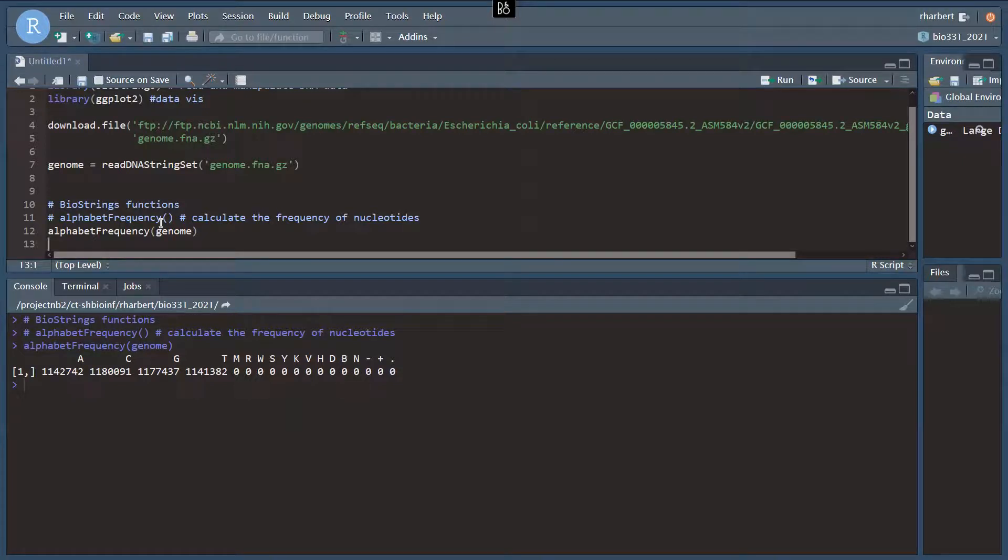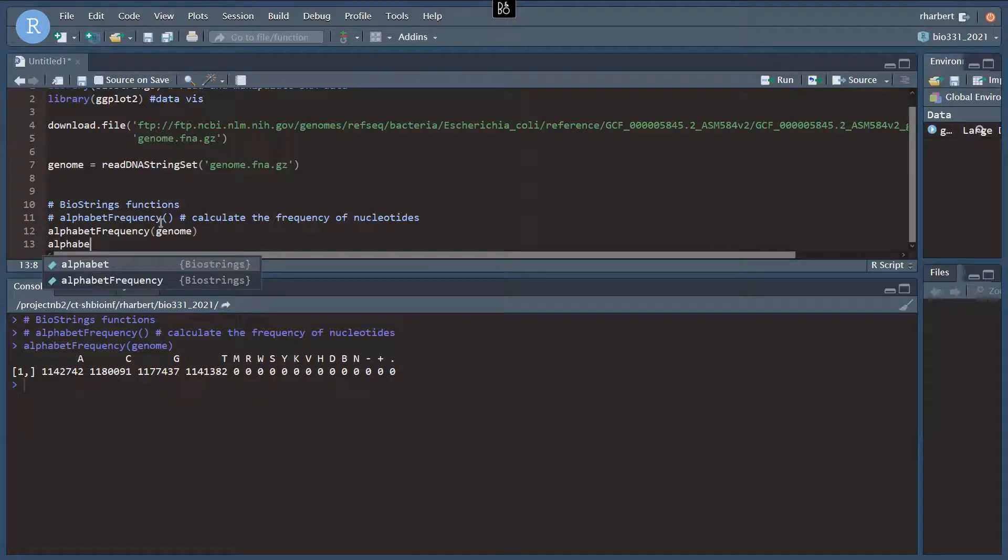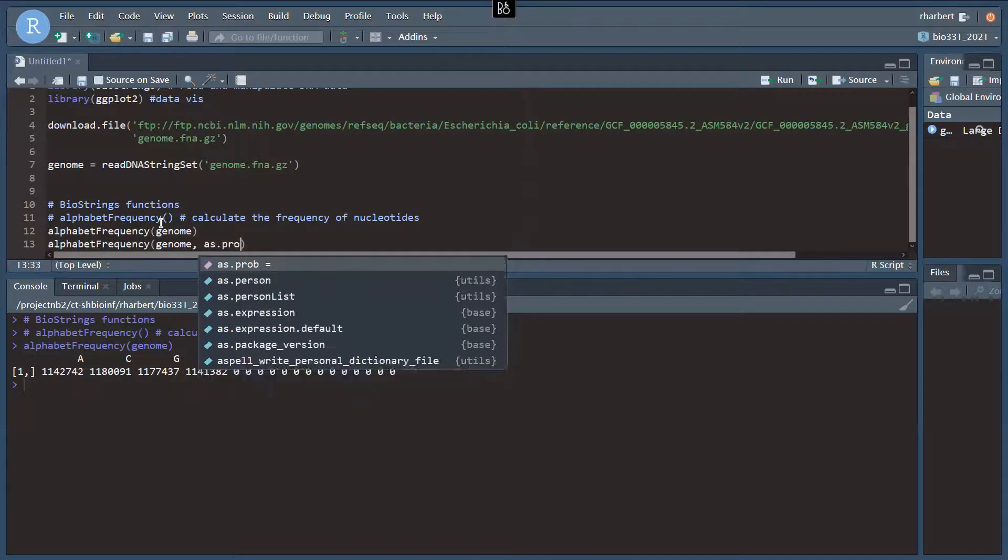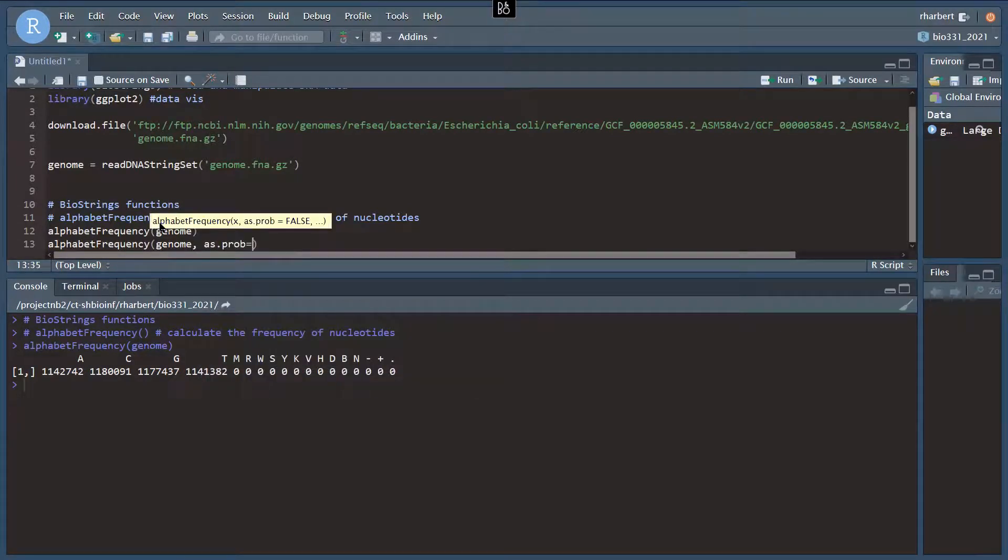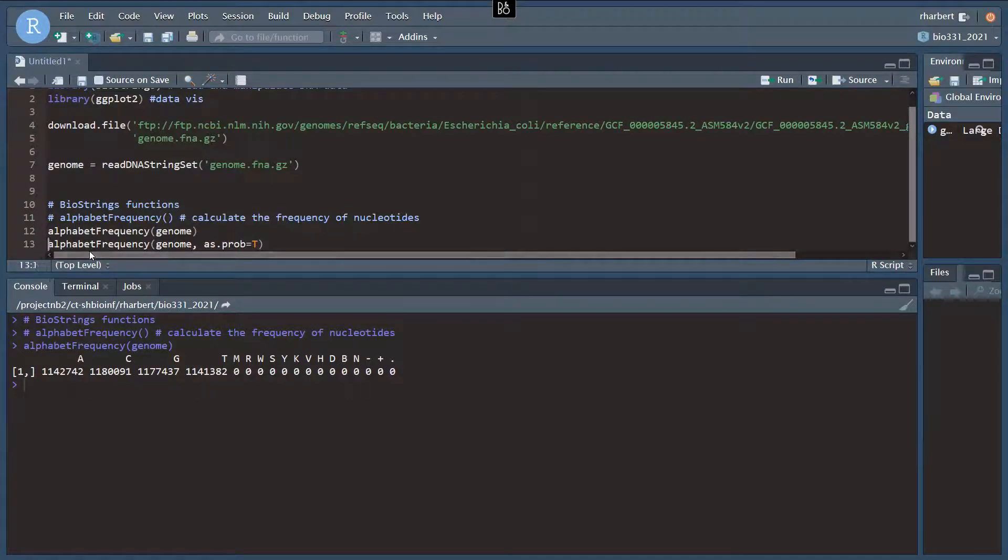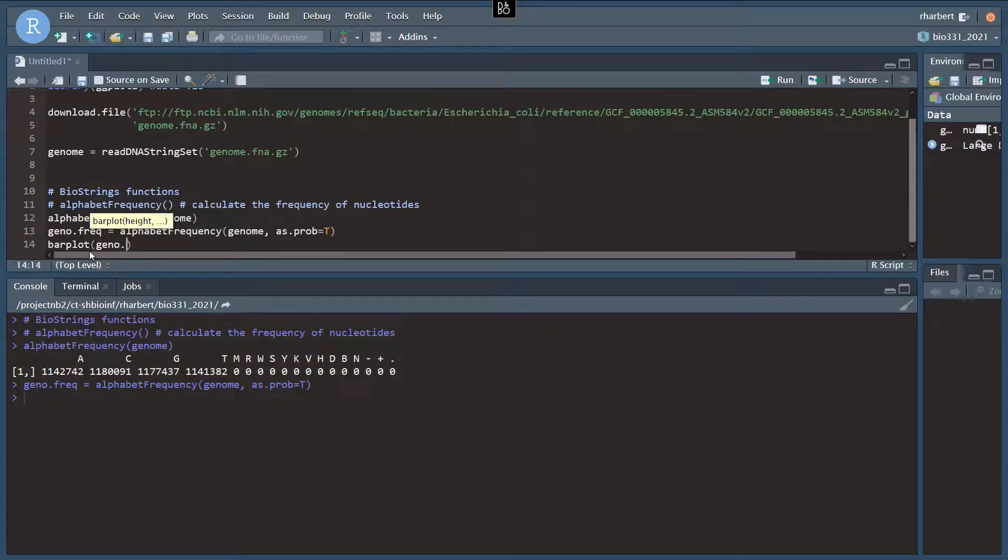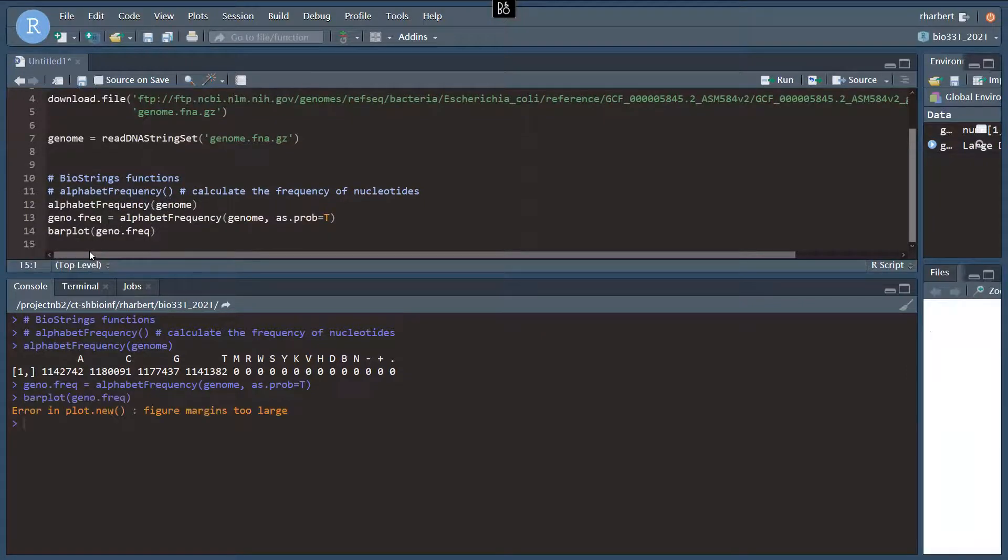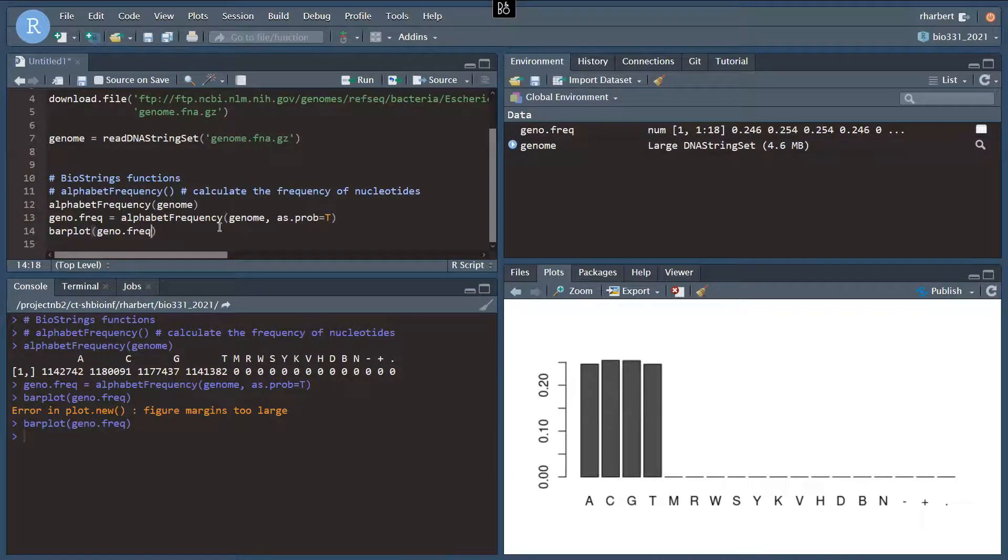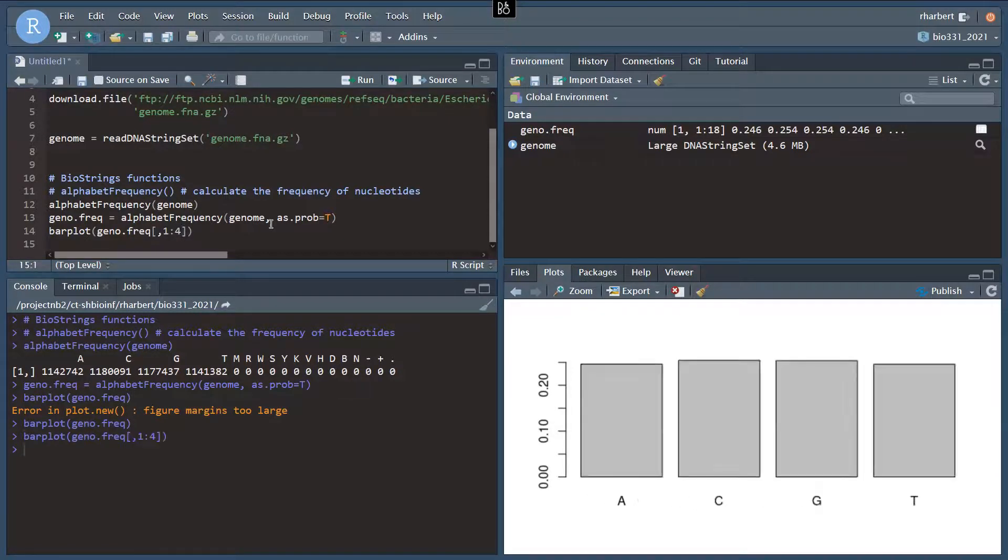So this is just a straight ACGT FASTA file. We might be interested in something like calculating the frequency of C's and G's in the genome, the GC composition. And we could do that in a fairly straightforward way here using alphabet frequency once again. So alphabet frequency genome, this time we want to do as prob equals T to give us the proportion or probability of each nucleotide. I'm going to put that into an object. I'm going to call it geno-freak. And we could just bar plot geno-freak, just to check this. Bar plot geno-freak bracket 1, 4. So we just do the first four columns. There we go. That's better.